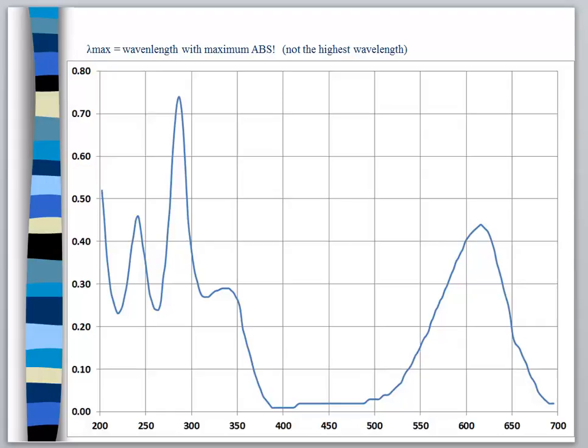I now know that molecules have particular favorites in the buffet line. Those favorites show up to me in the form of the peaks that I'm shown on the computer screen. However, they always have one particular favorite, and it is this favorite that I want to give them. And we call that the lambda max. So the purpose of the scanning is to allow me to determine what the lambda max is.